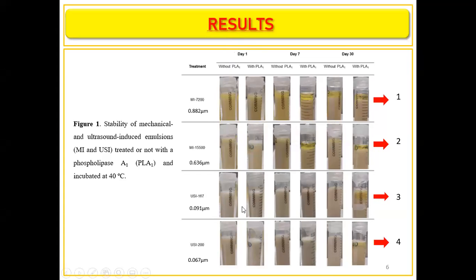So the difference between them is really clear. And when we add the phospholipase, after 7 and 30 days, we see a real difference in the stability of our emulsions. In the mechanically induced emulsion, after 7 days, we see a clear separation of our phases.